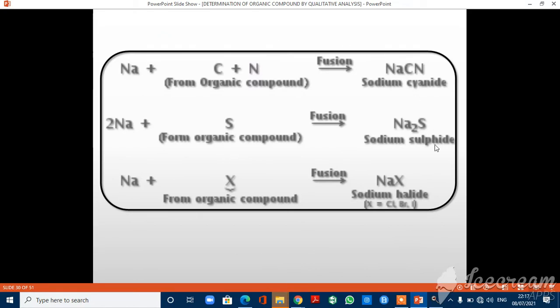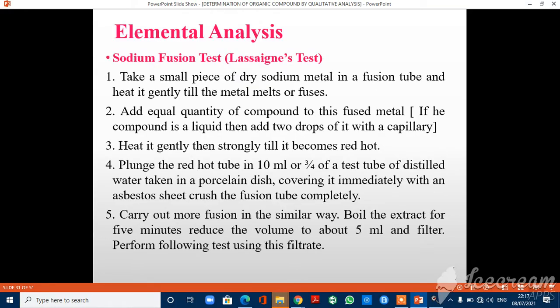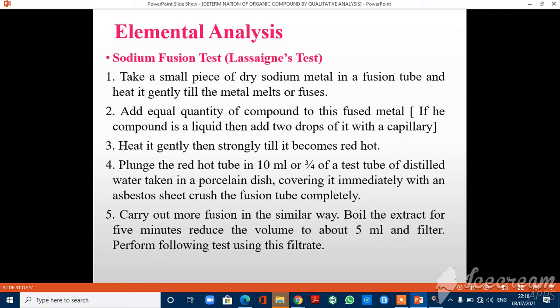These are the reactions of sodium elemental analysis. For the procedure: take a small piece of dry sodium metal in a fusion tube and heat it gently until the metal melts or fuses. Add an equal quantity of compound to this fused metal. If the compound is liquid, add two drops with a capillary. Heat gently, then strongly, until it becomes red hot. Plunge the red hot tube into 10 ml of distilled water in a porcelain dish. Cover it immediately with an asbestos sheet and crush the fusion tube completely. Carry out more fusion in a similar way. Boil the extract for 5 minutes, reduce the volume to about 5 ml, and filter; then perform the following tests using the filtrate.